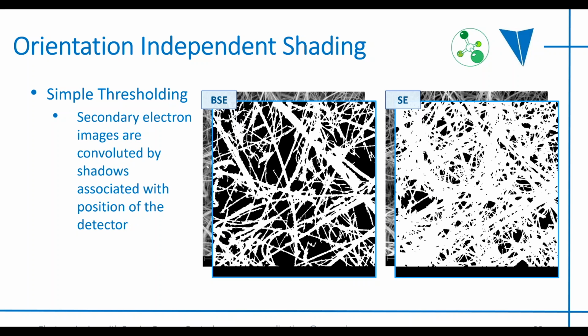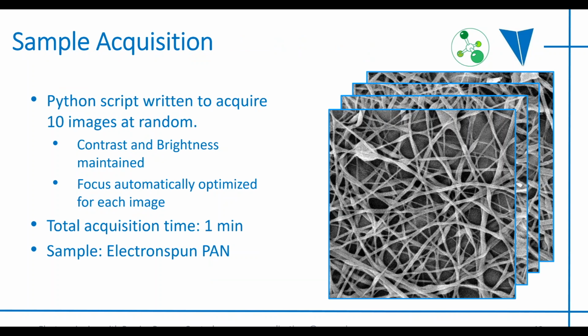Probably the fibers that are properly found have the potential of being half the size on account of the bright edge or something like that. So secondary images are really great for looking at, they give you some pretty depth and good coloring information sometimes, but the backscatter is really necessary for post-processing.